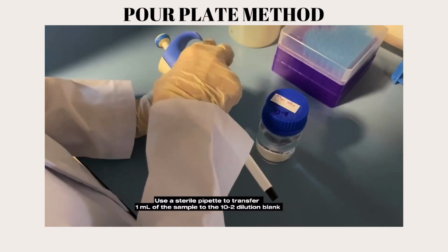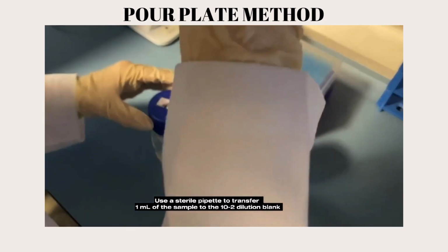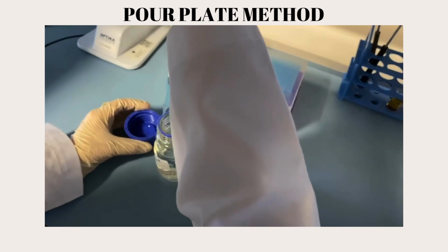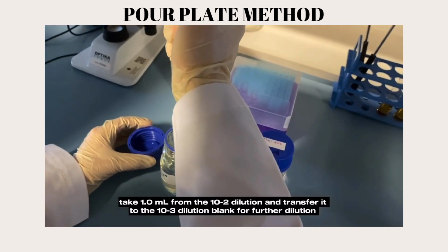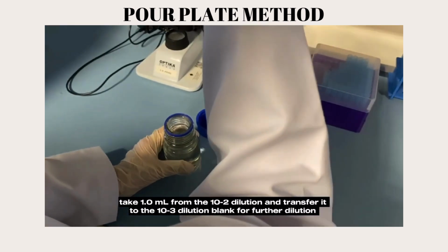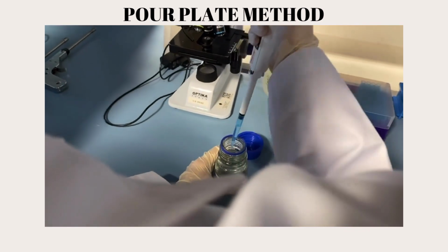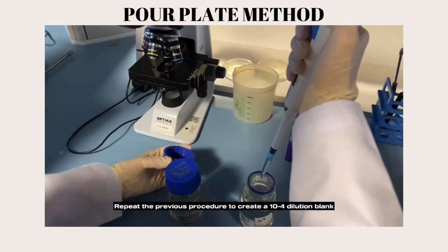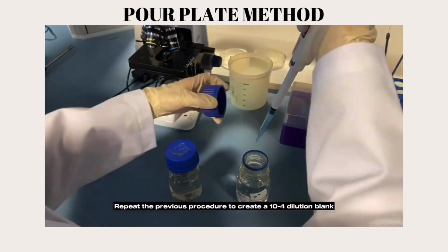Use a sterile pipette to transfer 1 ml of the sample to the 10 power of -2 dilution blank. Take 1 ml from the 10 power of -2 dilution and transfer it to the 10 power of -3 dilution blank for further dilution. Repeat the previous procedure to create a 10 power of -4 dilution blank.